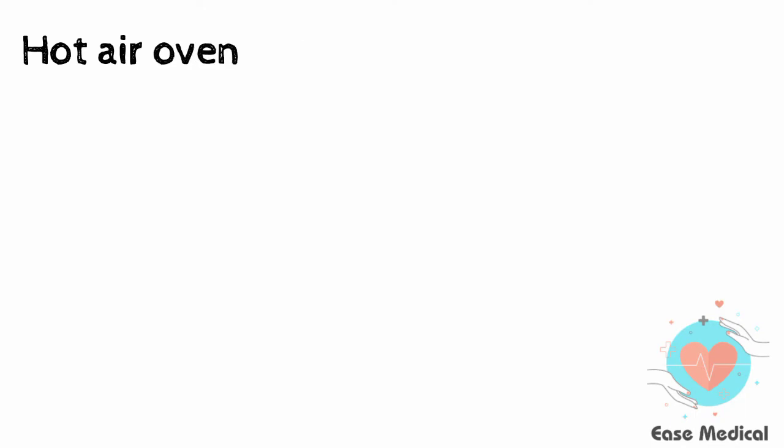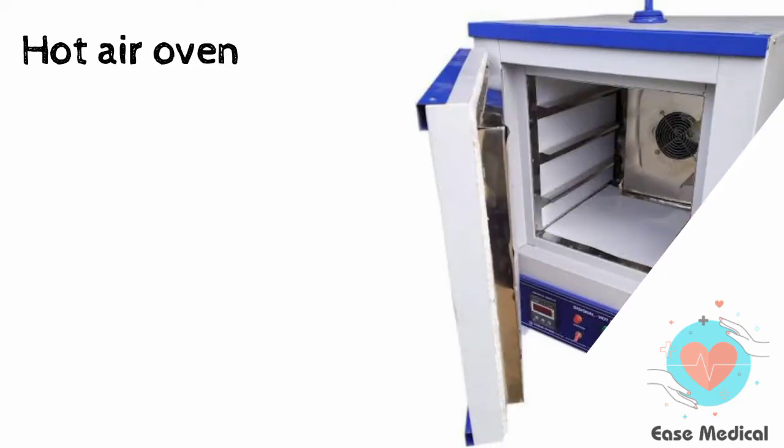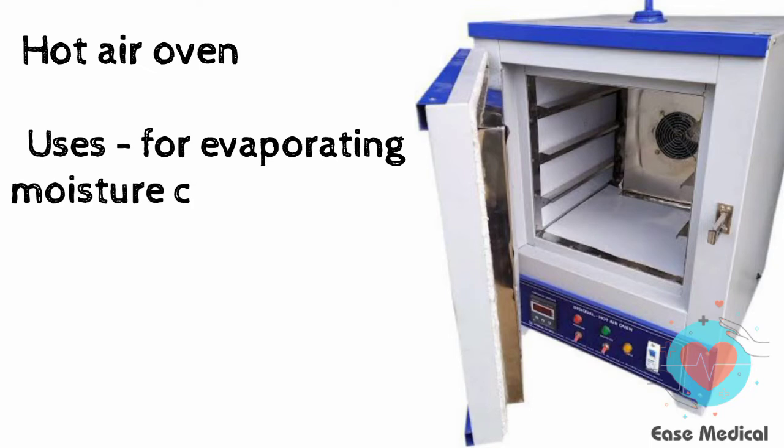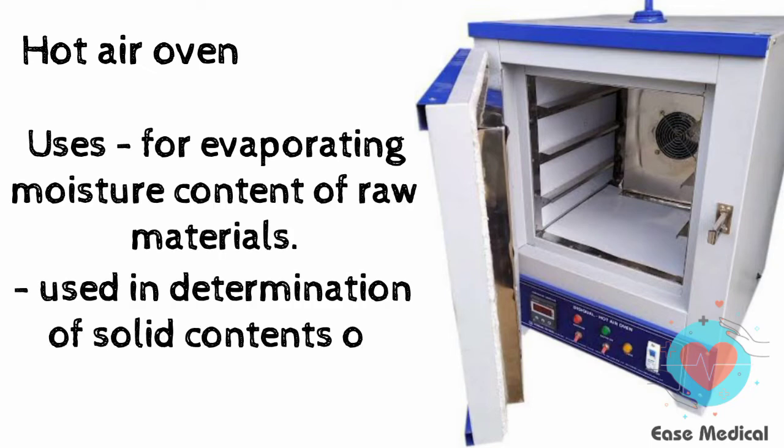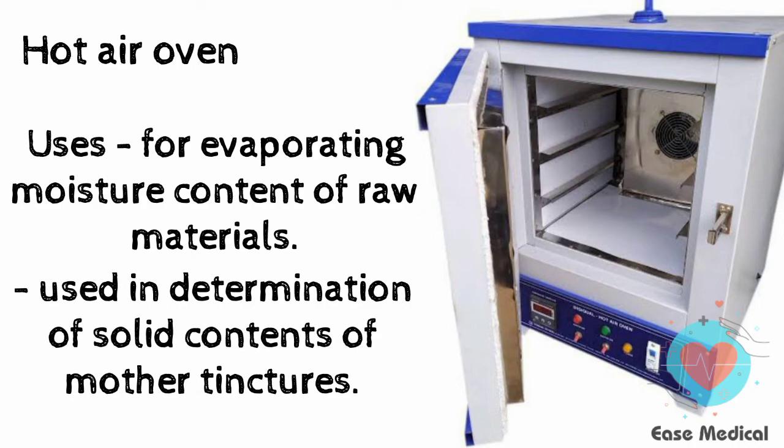Next, hot air oven is a small almirah-like chamber. It is used for evaporating moisture content of raw materials. Also used in determination of solid contents of mother tinctures.